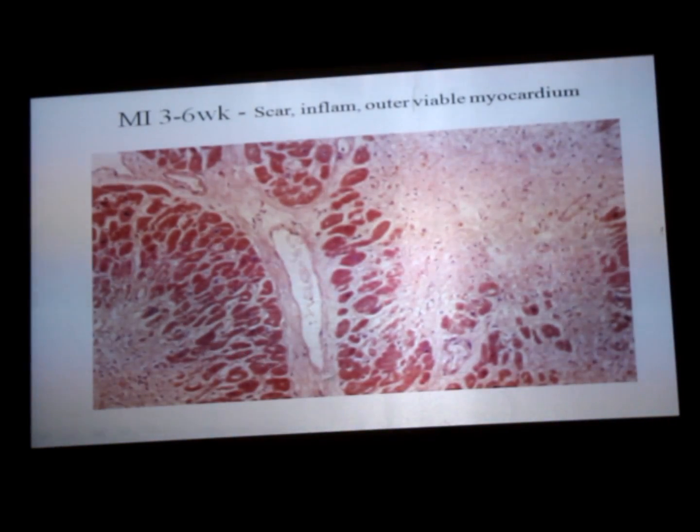This outer part is the viable or live myocardium, whereas this was the part which was affected due to decreased blood supply. The patient suffered severe pain because of this, which is known as a heart attack, and this area converted itself into a useless tissue, okay, which is nothing but scar. Now this part cannot take part in the normal function.